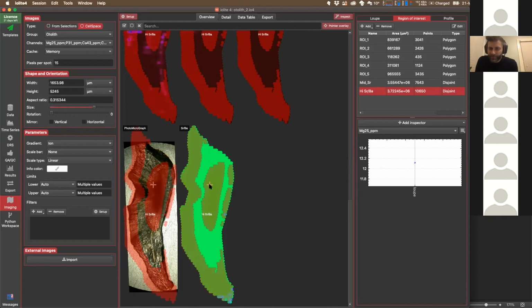Dave asked a question saying, I saw that you can plot spatial data using a linear or log scale. Can you plot as percentiles? It is an approach that has been used for field mapping of geochem data, and I've always found it very useful. Not at the moment, but that's a good suggestion.